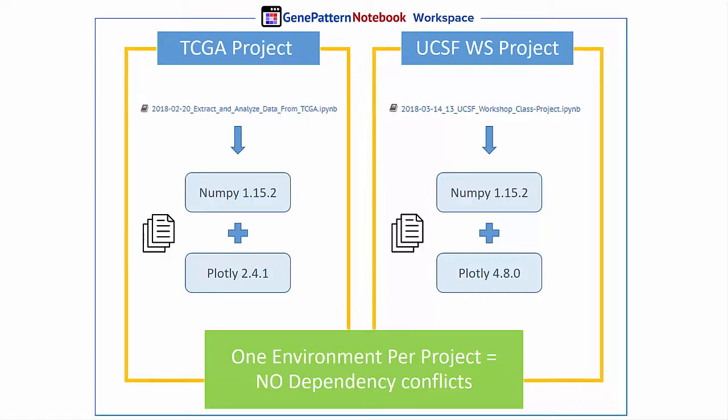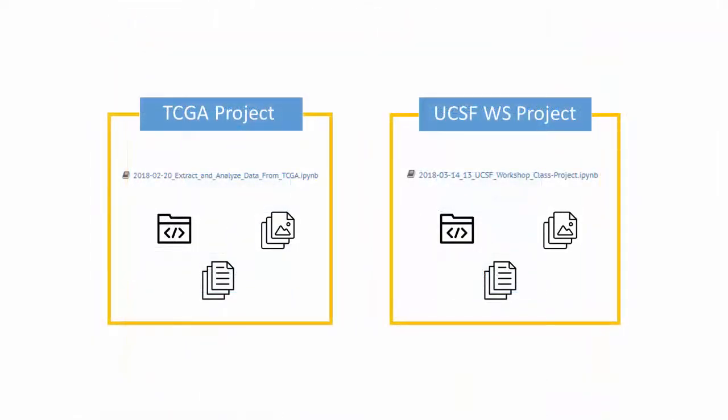Even if you aren't looking to install your own extensions or libraries, projects provide another layer of organization to your work, allowing you to arrange data, notebooks and images, etc., beyond the use of folders in the workspace view. So, how do projects look and feel?